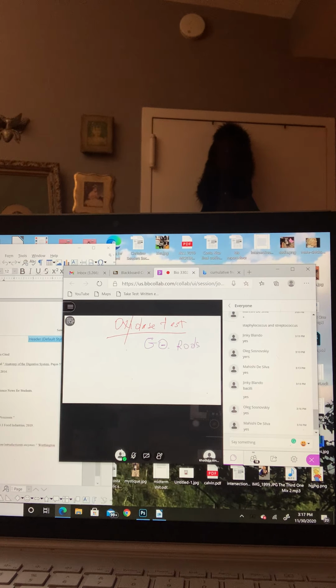Okay, so it's important to help you identify or name your microorganisms, because for this practical exam in your lab report, you have to give me the name of two microorganisms. Okay, if it's E. coli and staph or something else. So the oxidase distinguishes between gram-negative rods or bacilli. We have the important one that is oxidase positive.